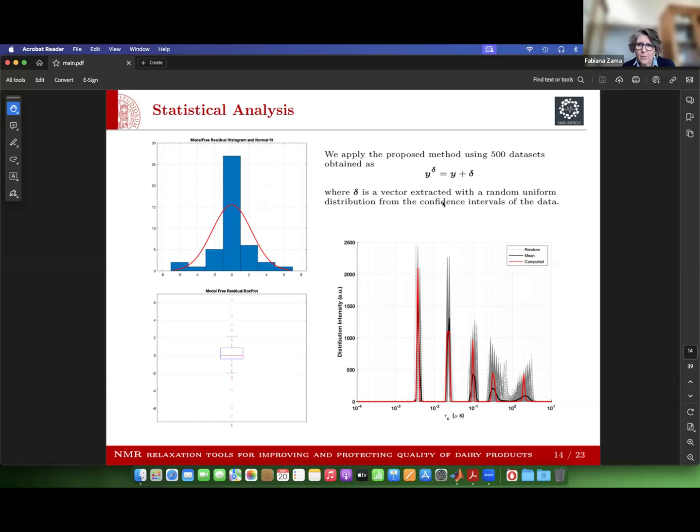Moreover, if you have, for instance, paramagnetic systems, for this case which Pedro presented, the solution of manganese ions, this is a very simple paramagnetic system. In fact, it can be described with some approximation in terms of Lorentzian functions.